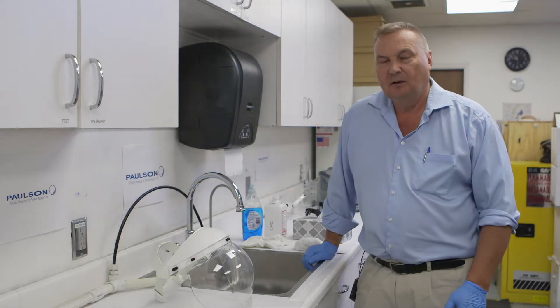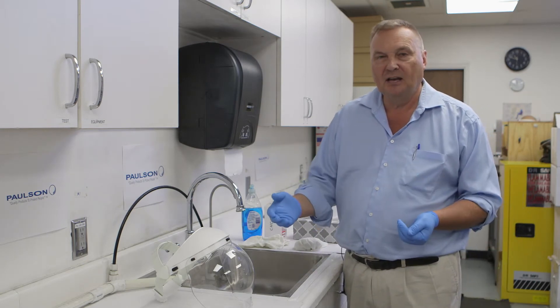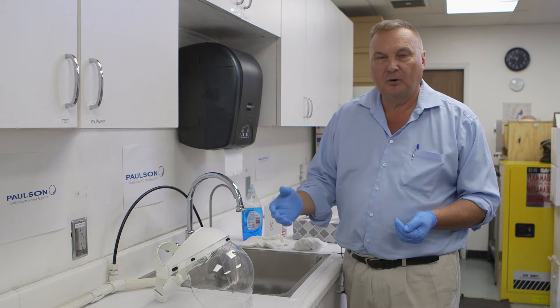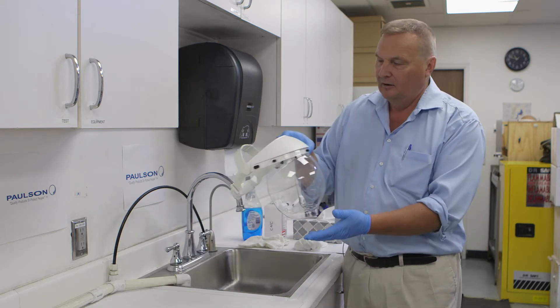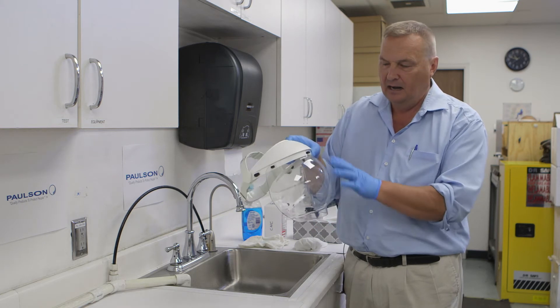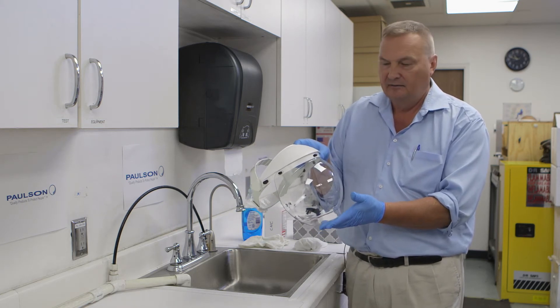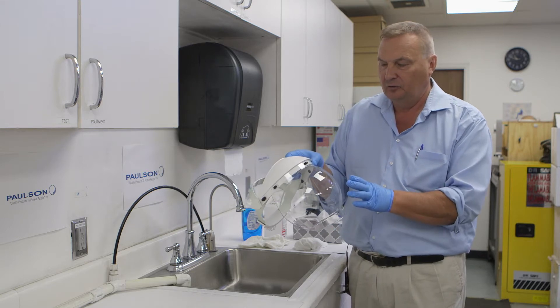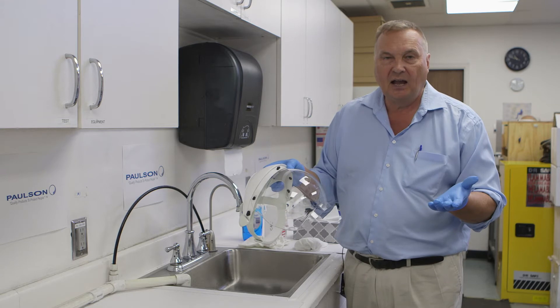Welcome to the topic series. My name is Roy Paulson. Today we're talking about how to properly sanitize and clean your personal protective equipment. I have here one of our typical headgear, and this is a bubble-type face shield called the IM-11 facial.